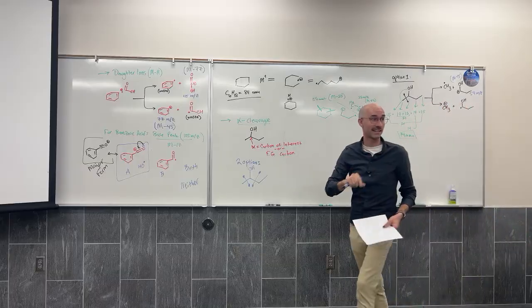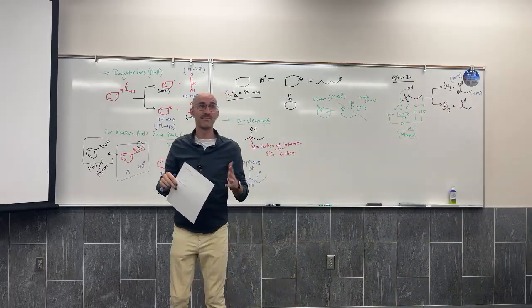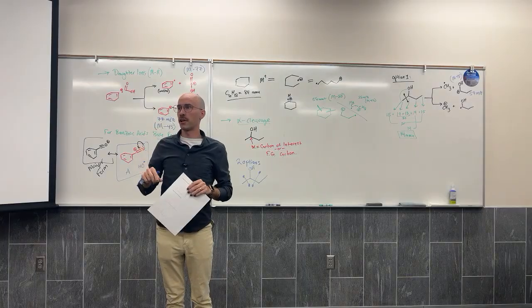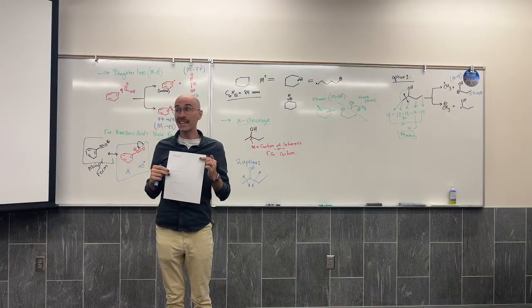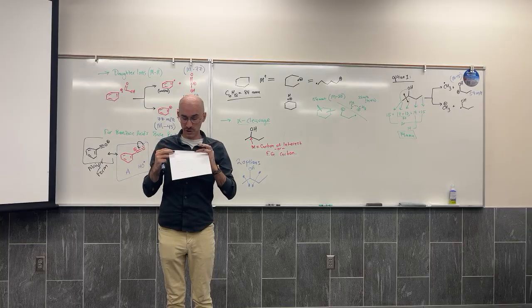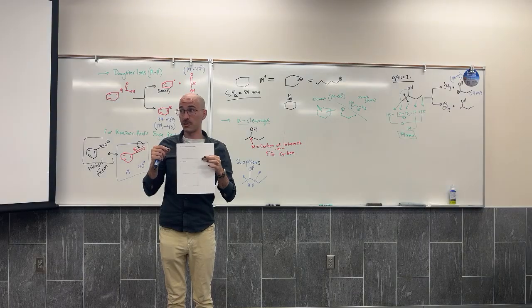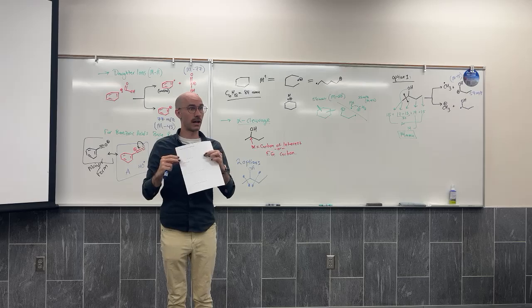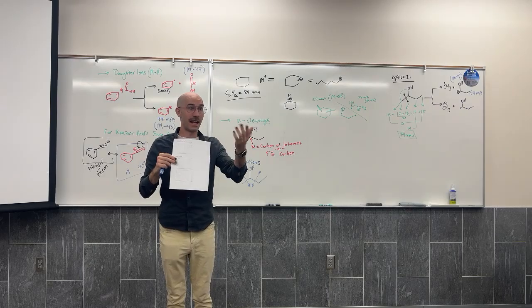You can always predict it, but it might not appear. Which is why earlier you guys asked, how do you know where the molecular ion is? In theory, it's the highest mass signal, but when you look at this one, do you really see a signal at 74? No, honestly, the biggest one is 73, which means it's the M minus 1 signal that's showing up the most. A hydrogen getting kicked off.